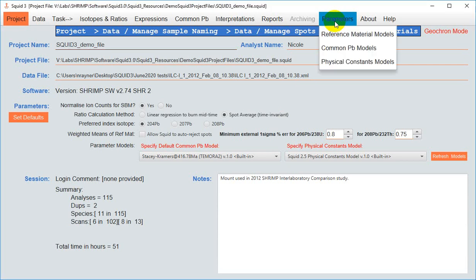There are three types of models: reference material, common lead, and physical constants, each of which contains sets of accepted values for that particular parameter.